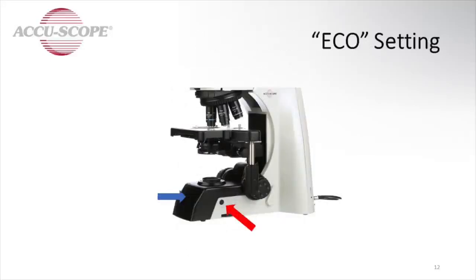The eco setting. The EXC-500 microscope is equipped with an auto shutoff feature or eco mode to conserve energy and preserve the life of the bulb. Eco mode activates when the microscope is unattended for 15 minutes. The eco sensor, identified by the blue arrow, is located on the front of the microscope base.